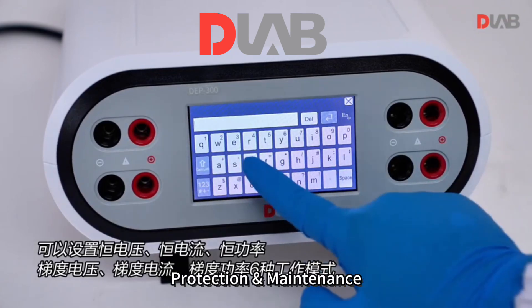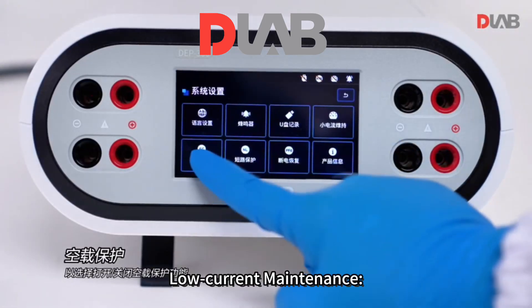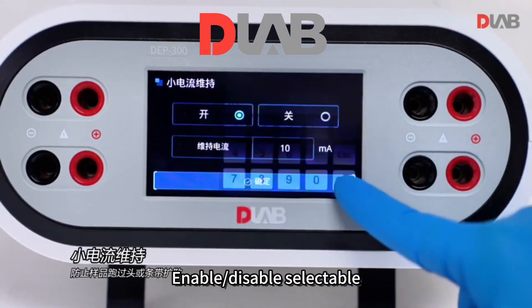Protection and maintenance: no-load protection enable/disable selectable; low current maintenance prevents sample over-running or band diffusion; power-off recovery enable/disable selectable.